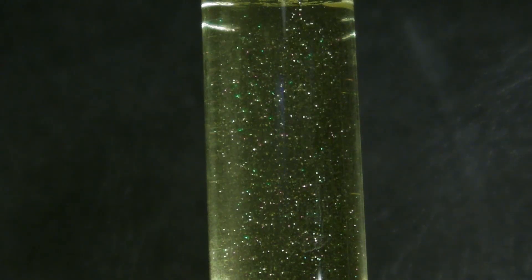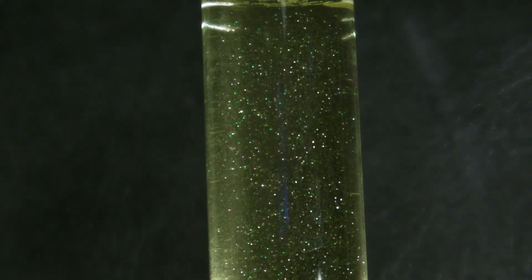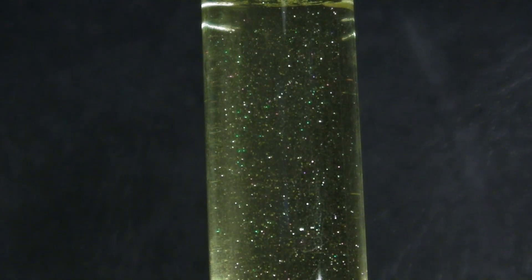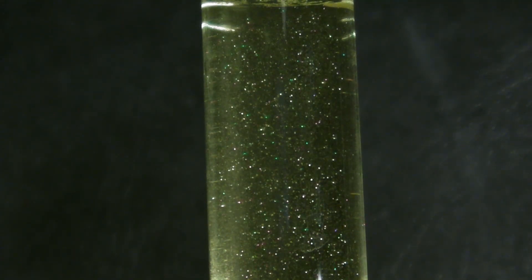When the solution cools down, the lead iodide precipitates out again and forms shiny flat crystals. This demonstration is also called golden rain.